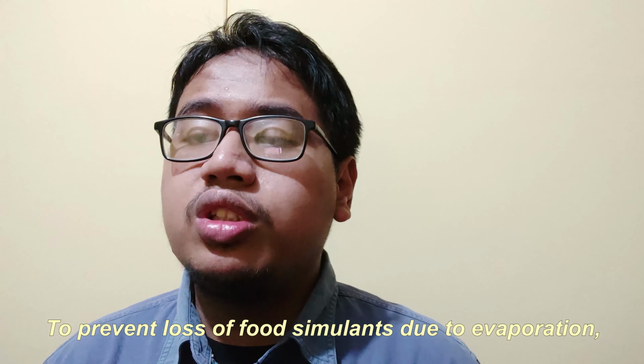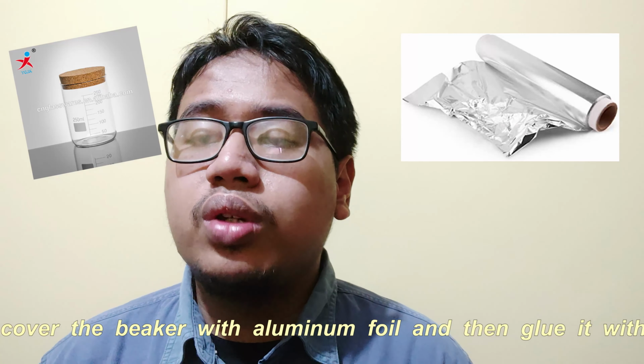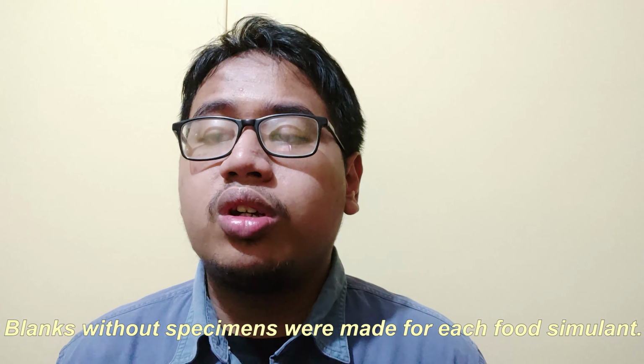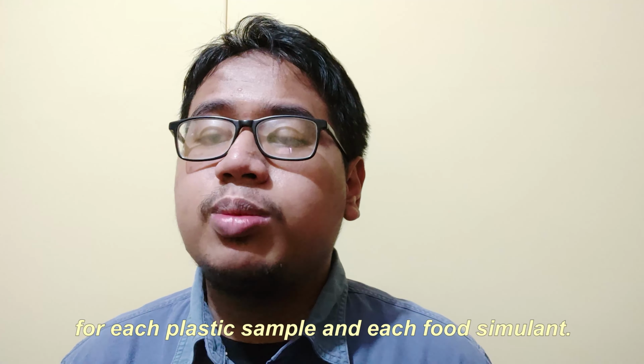To prevent loss of food simulants due to evaporation, cover the beaker with aluminum foil and then seal it with parafilm. The food simulant level is marked for verification. Blanks without specimens were made for each food simulant. The total migration test was carried out 3 times for each plastic sample and each food simulant. After conducting the migration test, the practitioner now has to calculate the total migration.